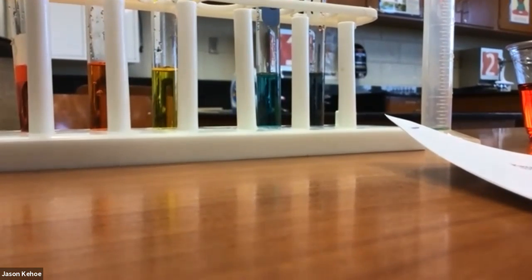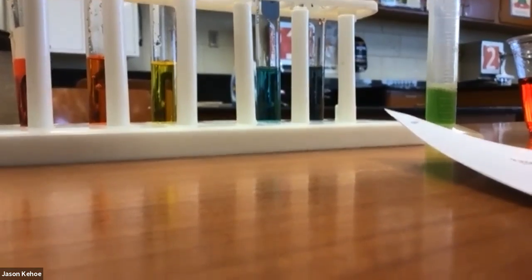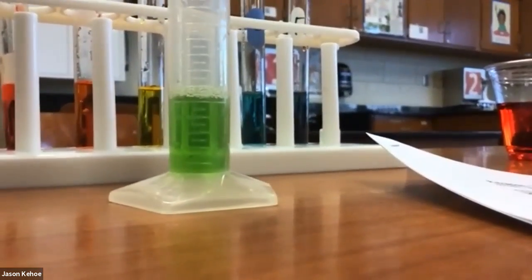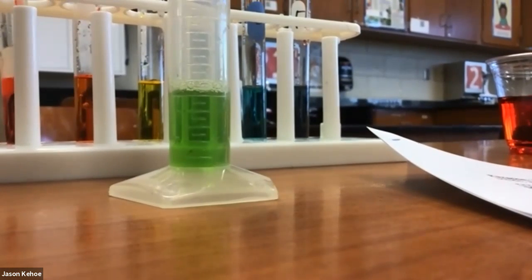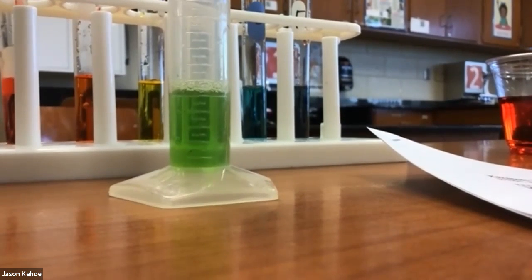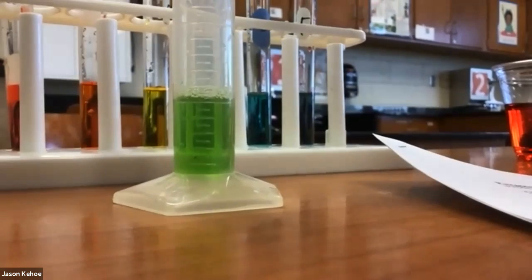I'm just going to double check the volume of one of them. We got a little bit of foam there, but it looks to be ever so slightly above 5 milliliters, not quite to 5.5. Maybe let's call it 5.2.